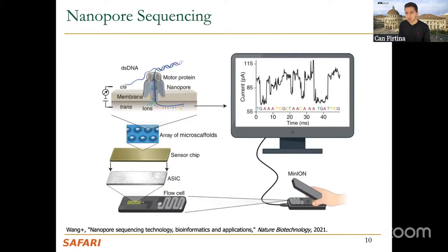I'll cover in this lecture hopefully also how Illumina works, how sequencing by synthesis works. But I'm starting with nanopore sequencing because this is something also dear to my heart. But I also believe it has many unique and new opportunities that perhaps we should tackle now.